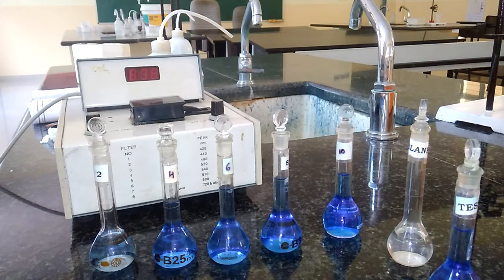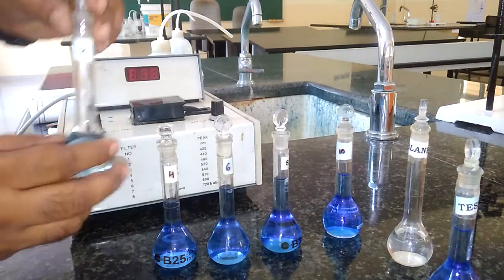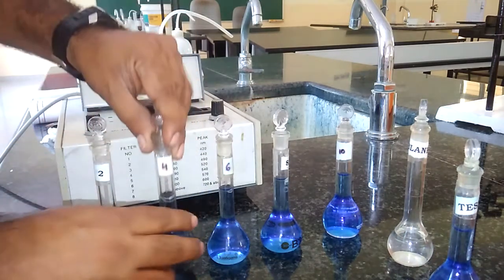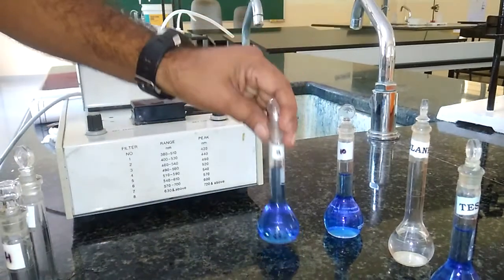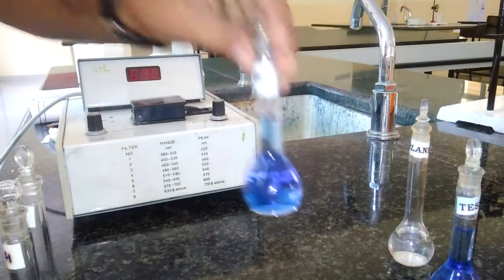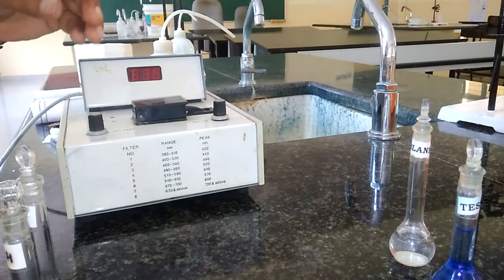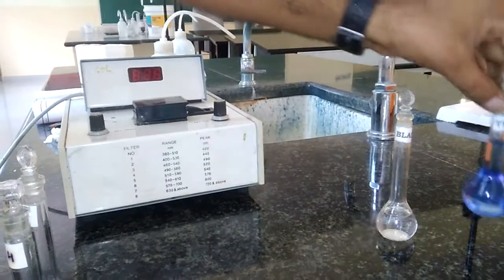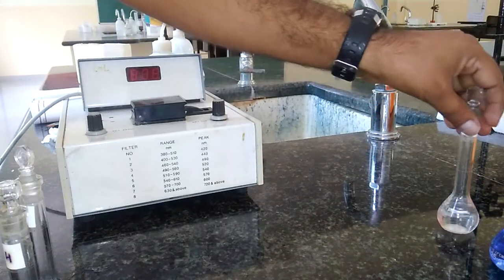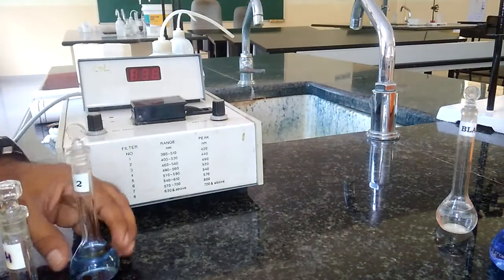In the second step, we need to prepare standard solutions of copper sulfate by taking 2 ml, 4 ml, 6 ml, 8 ml, and 10 ml of copper sulfate. After this, we need to prepare one blank solution and also the test solution. Now I am going to show you how to prepare these standard solutions of copper sulfate.